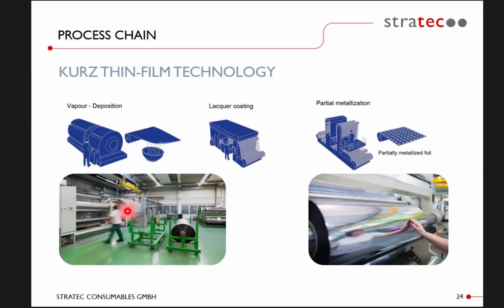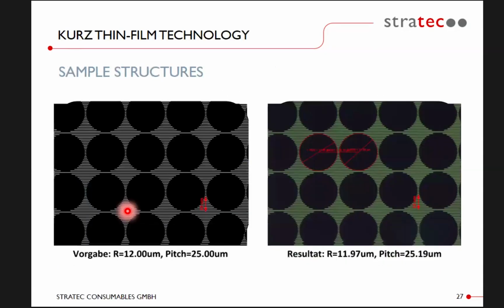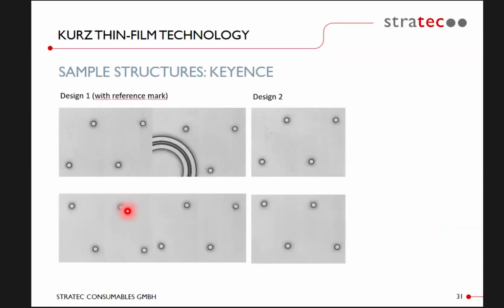So that's one of their, this is not a secret, I can talk about it, but this is how you usually would go. It's just the transfer. You can use it just as a transfer material, right? You can stick with the PET, right? When we did this project with the 4-micron pillars, we still worked with the PET because PET is a wonderful material, right?